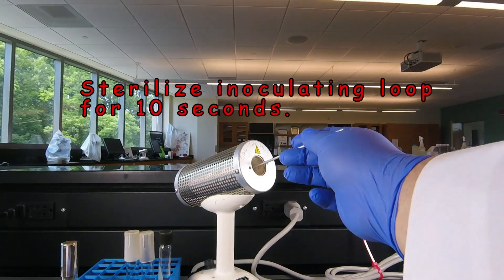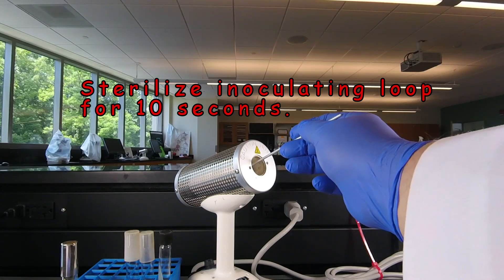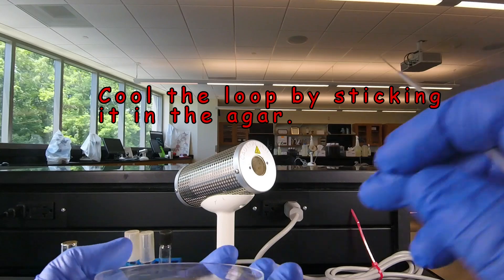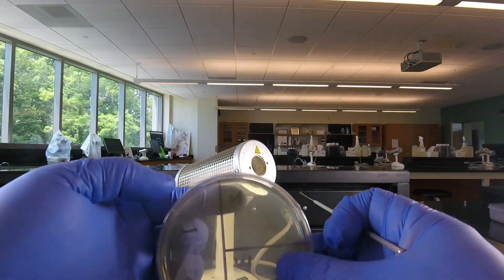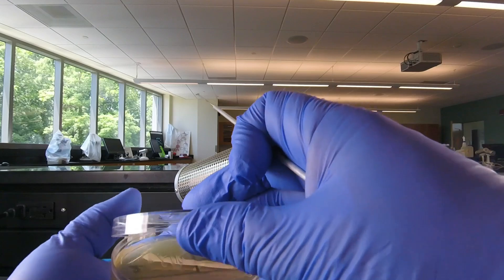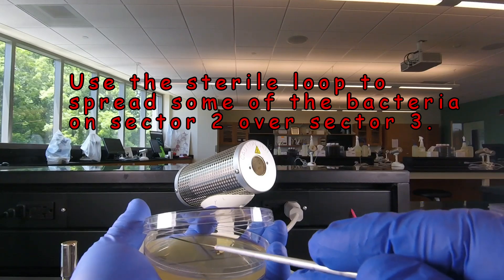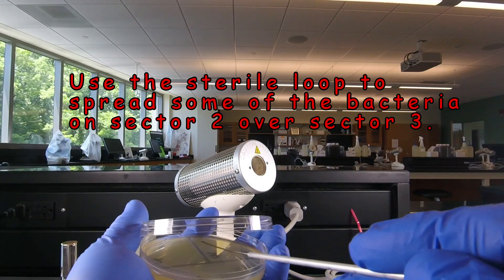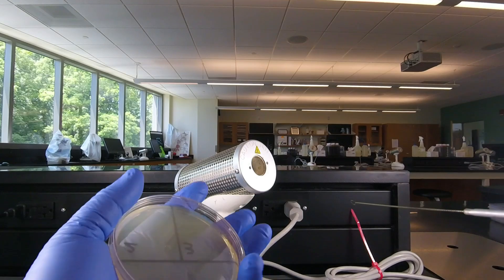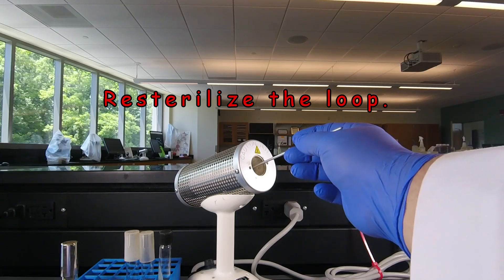Now we sterilize the loop for 10 seconds again to kill any bacteria on it, then stick it in the agar to cool at the very edge. We rotate the plate so sector two is now at nine o'clock, open the lid, go up to 12 o'clock over into sector two, drag the loop through twice to pick up some bacteria, and then spread that out over sector three without dragging it through again, being very careful not to touch sector one. At that point we're done with the streaking. We burn the remaining bacteria off the inoculating loop — 10 seconds in the back-to incinerator.